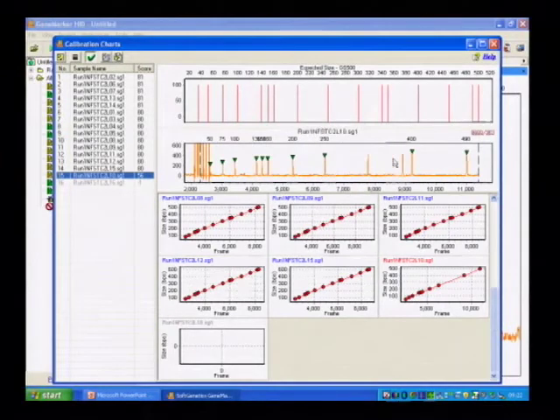Yep, so in terms of data analysis, that's what I'm presenting. And if you have any questions, I'd be happy to go through any of these channels or lanes and look more closely. Can you go back and show us the size standard on lane 15 again? Lane 15. This is the one where a couple of them didn't come up, wasn't it? Or they didn't get assigned to the size standard? Oh yeah, that was two lane peaks. That was lane 10. This one. Right, these two were not assigned.